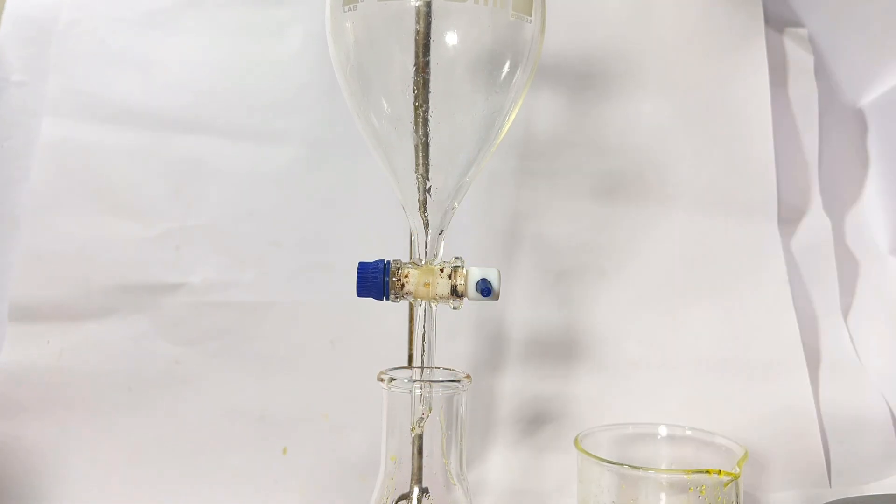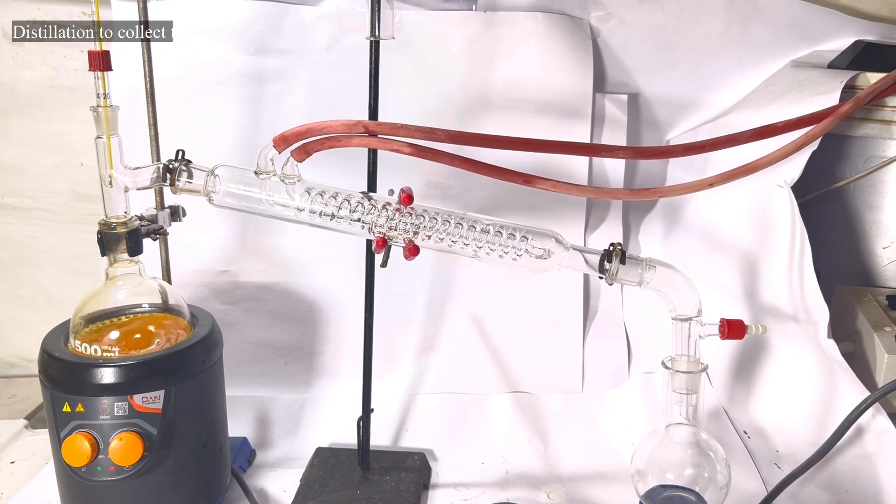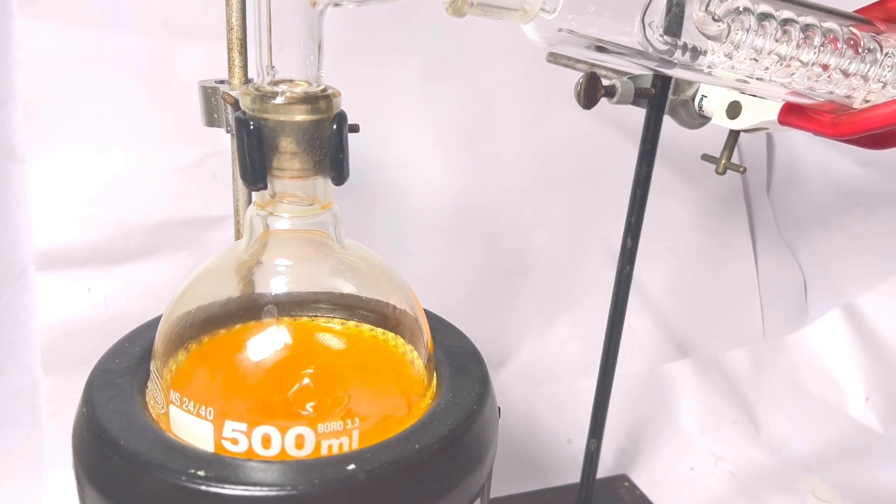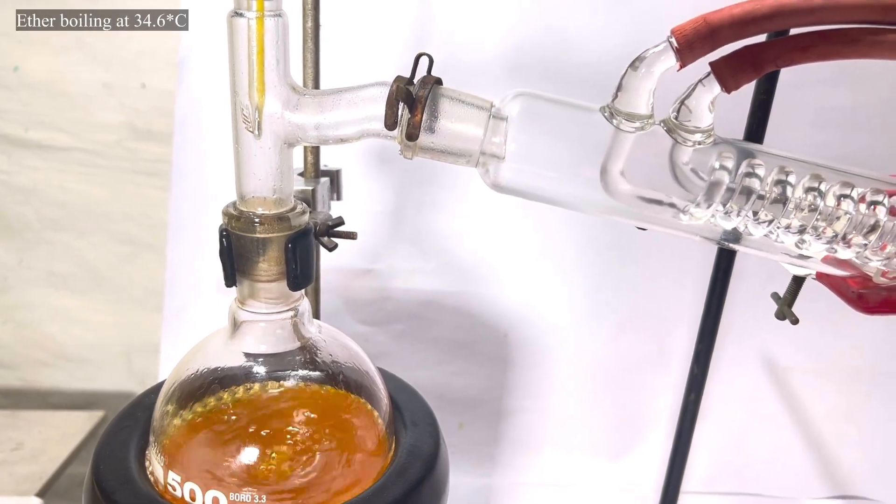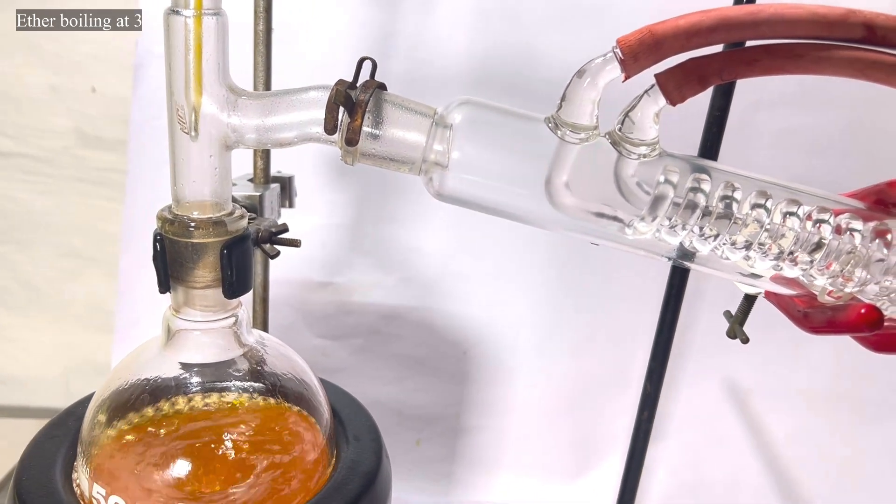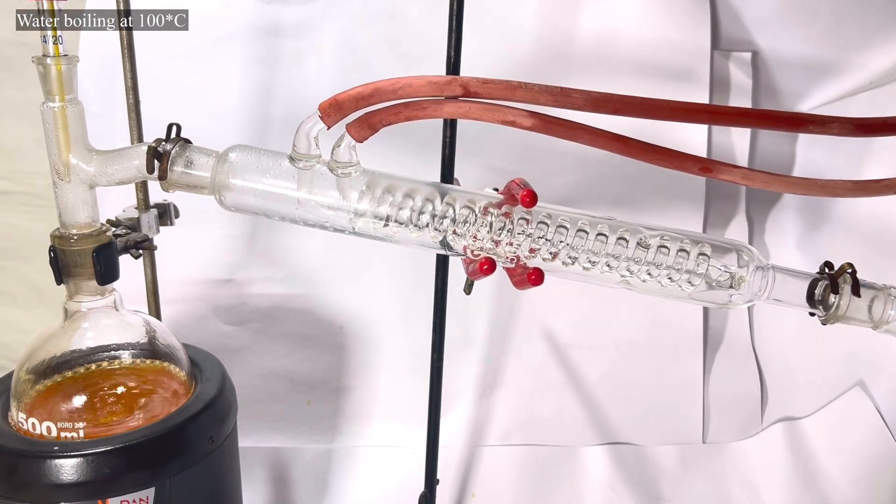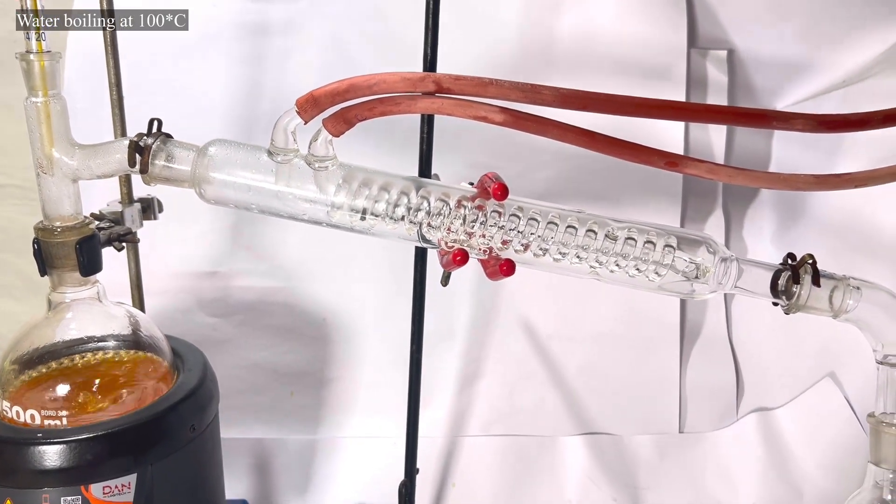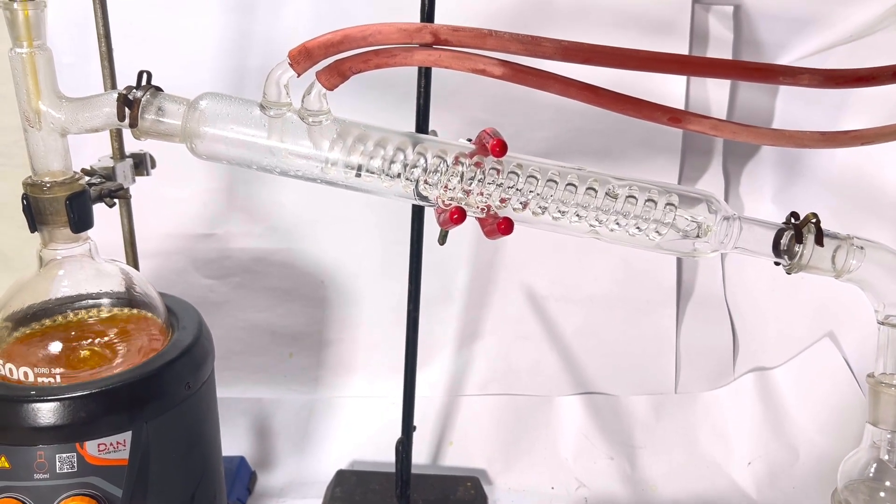Finally the flask containing cinnamaldehyde, benzaldehyde, diethyl ether and some water was set for simple distillation. Initially diethyl ether starts to boil and condenses at 34.6 degrees C. After all the ether has passed over, the temperature spikes to 100 degrees C in the thermometer and the residual water starts to pass over the condenser.